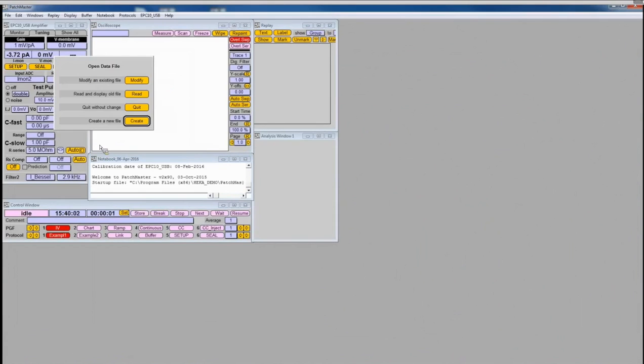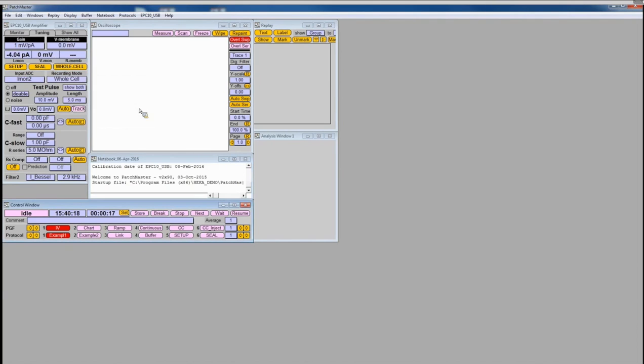This shows that the EPC is now started, and it will take a minute or two because there are lots of tests being done. So it tests the whole hardware and makes sure that everything is fine. Then this little welcome window pops up, which you can close by pressing quit. And we can also disable this little welcome window, which I will show you in a minute.